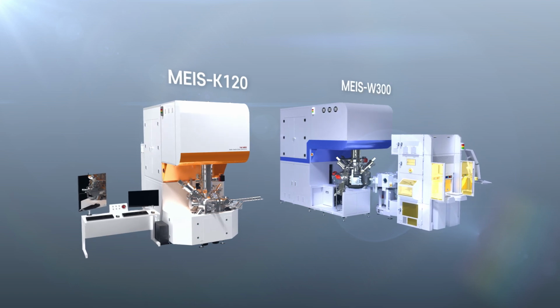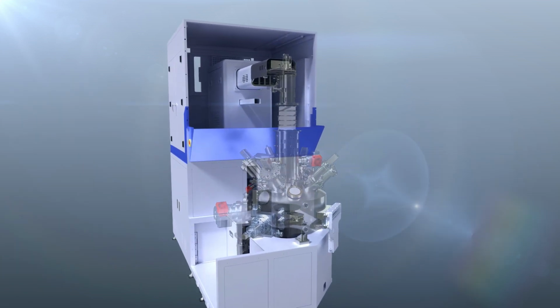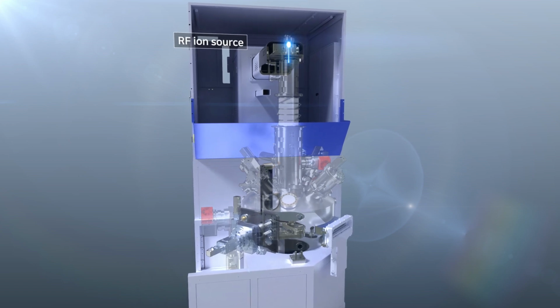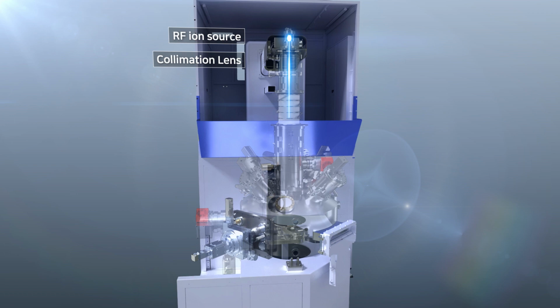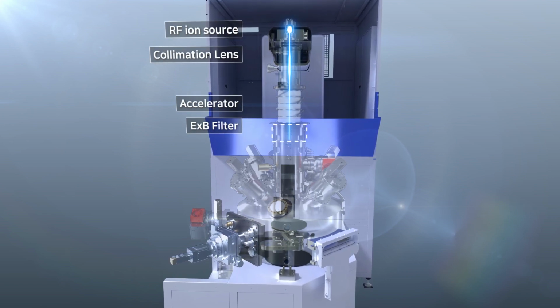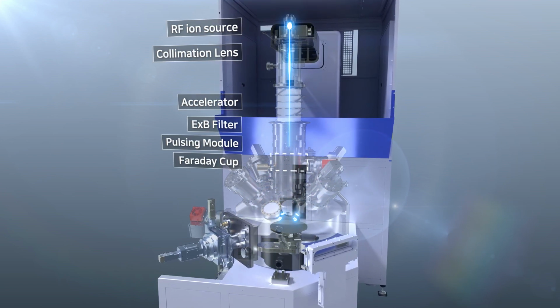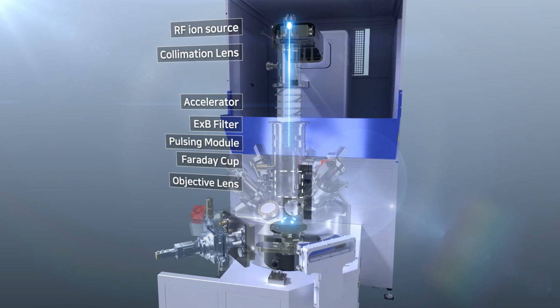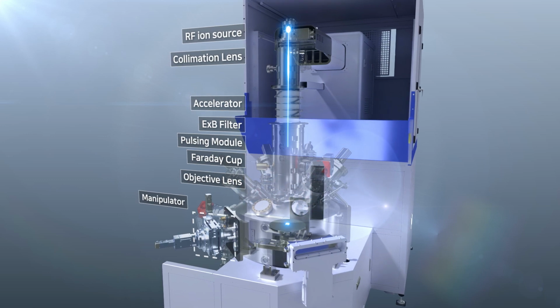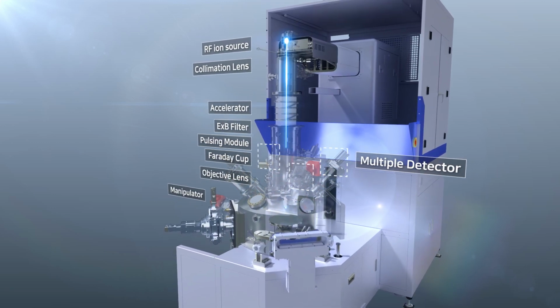The MEIS provided by HB Solution is a time-of-flight analyzer and is called TOF-MEIS. TOF-MEIS consists of the following components: an ion source that generates helium ions that are incident ions, a collimation lens that primarily focuses the ion beam, an acceleration tube to accelerate helium ions up to 100 kiloelectron volts, an E-cross-B filter that filters impurities other than helium ions, a pulsing module that generates pulse beams, a Faraday cup for accurate measurement of ion beam current, and an objective lens that focuses the ion beam on the sample. The generated pulse beams are incident on the sample on the manipulator. The MEIS spectrum is obtained by measuring the energy of the scattered particles from the sample using a TOF analyzer.